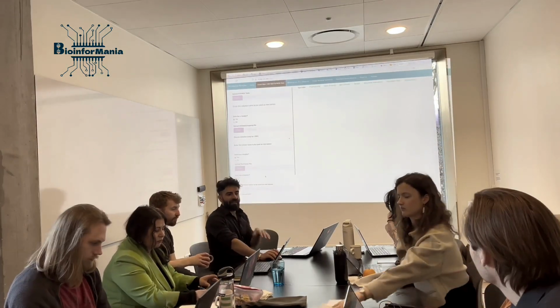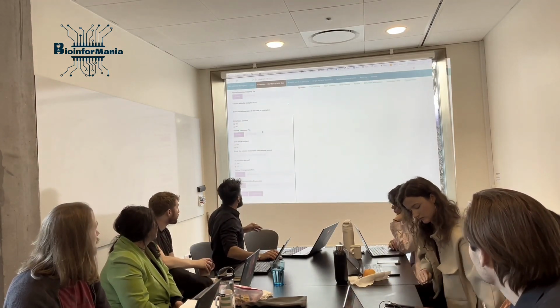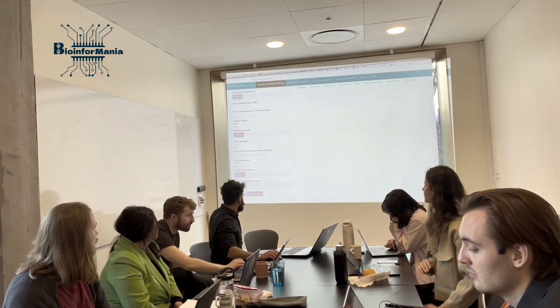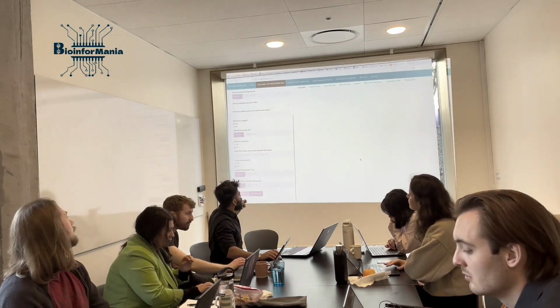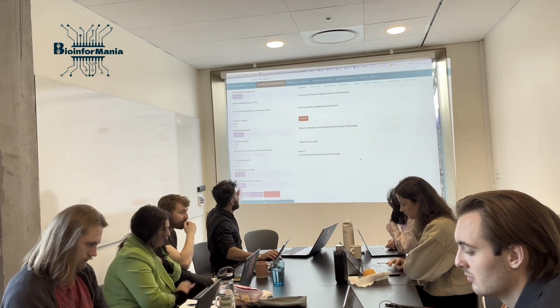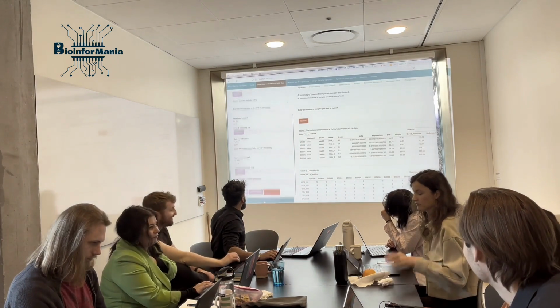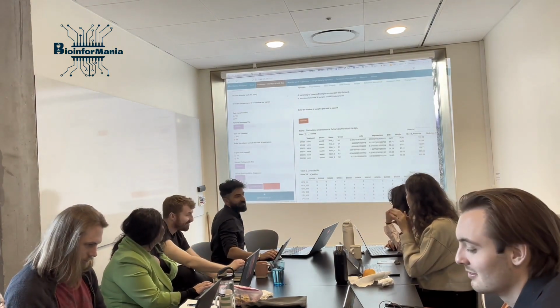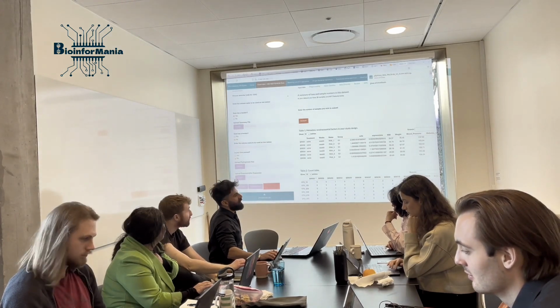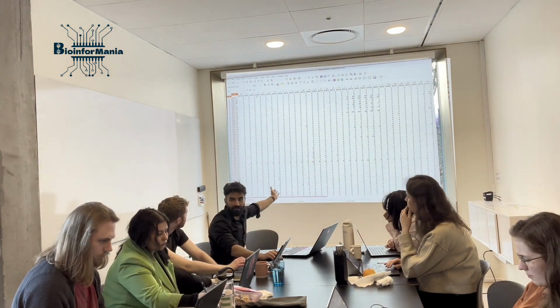You might not have test data with you, but I have already built in some test data that you can load here. Just click on this button, load test data, and then something should appear here. Don't overwhelm my CPUs, but if you click on this download data.zip, and then let's go up here and look into the shape of this data. That's it basically, and you also should get something like this.